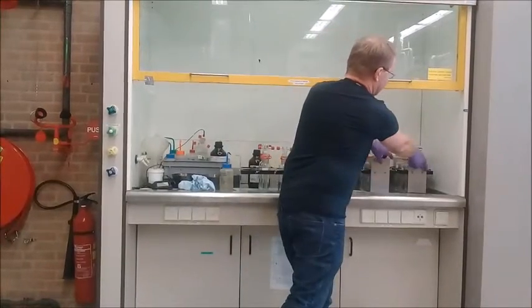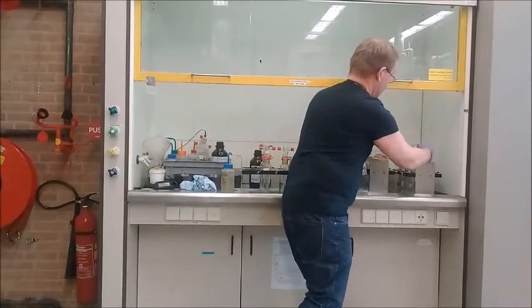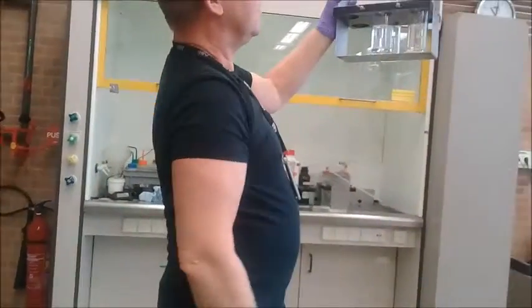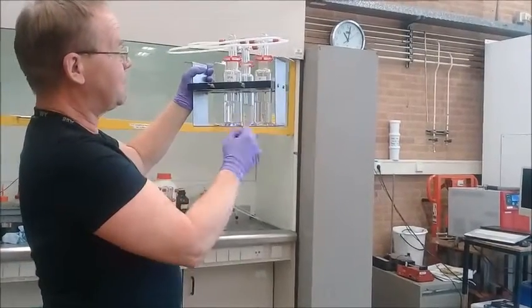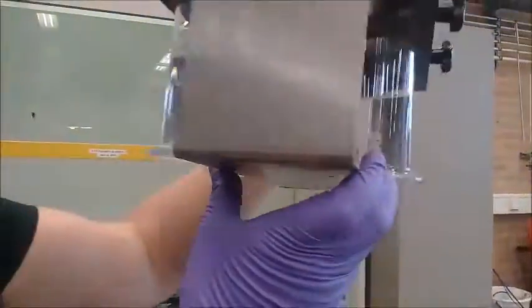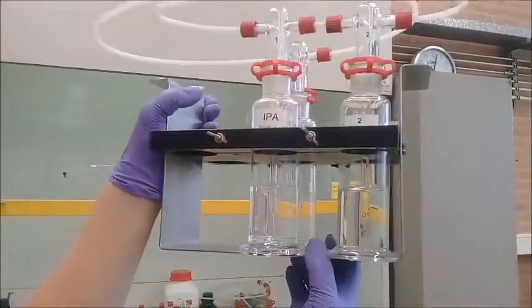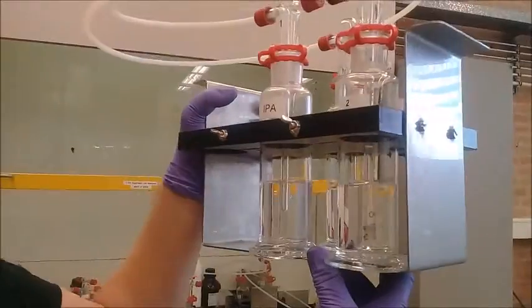Well, first I have here the first rack. And the first rack contains 3 bottles. One is without a frit for extra bubbles. The second one is with a porosity 0 frit, and the third bottle is also with some sort of frit. And in it you can see the clear IPA or isopropanol. So now I'm going to place first this set of bottles into the warm bath.